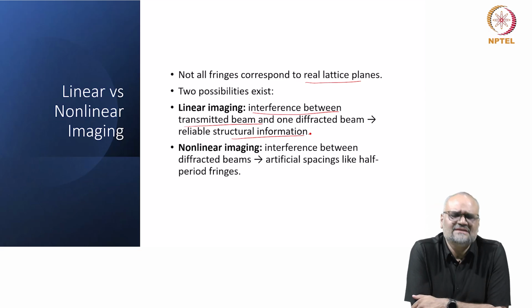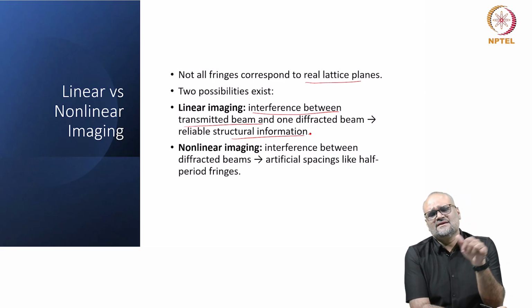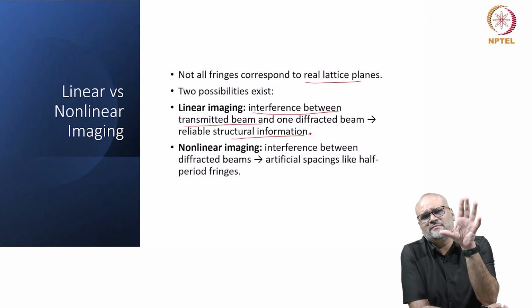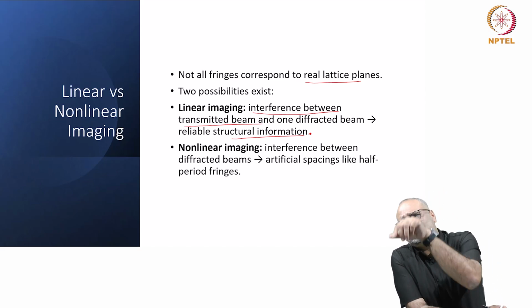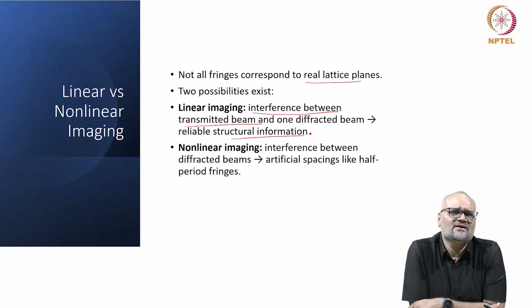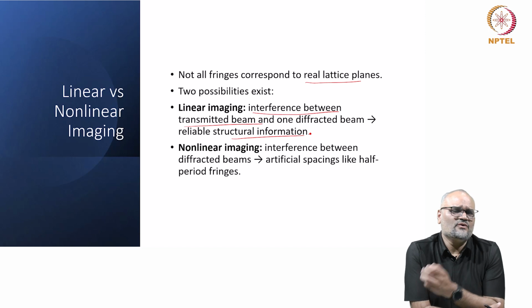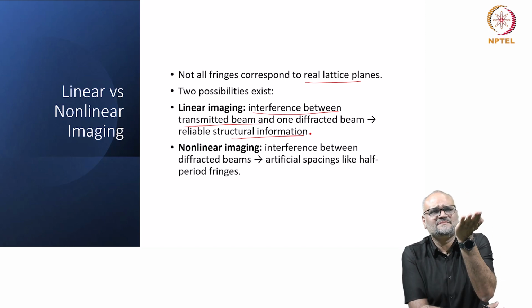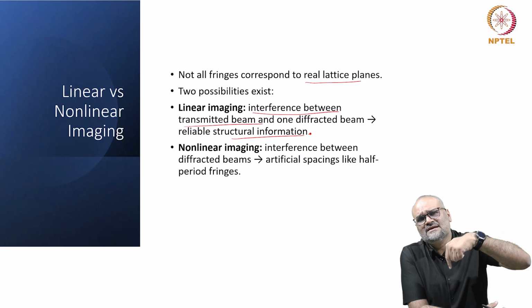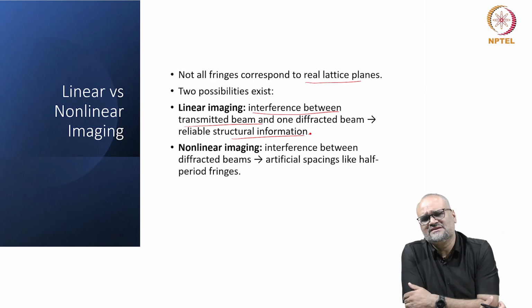If you remember in the previous lecture, I showed you that when you change the focus of the objective lens, we saw from an amorphous area how the Fourier transform was changing and how the contrast of the image also changes. So, you really do not know from which position in the real specimen which scattering center is contributing to the contrast you are recording in the image.